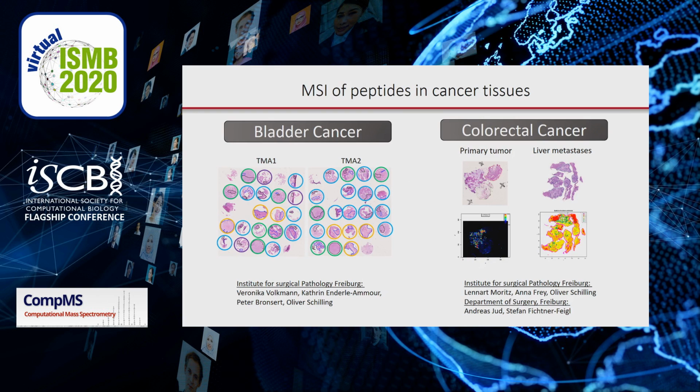Currently, we use the MSI Galaxy tools to analyze peptide distributions in a variety of cancer tissues. 2 examples include a study of a patient cohort with different types of bladder cancer, and another study compares matched primary tumors and liver metastases in colorectal cancer patients. In the bladder tissue cohort, we found discriminative peptide features that distinguish tumor and stroma histology, and another set of peptide features distinguished invasive versus non-invasive carcinomas. For more information on the bladder cancer study, please visit my poster.